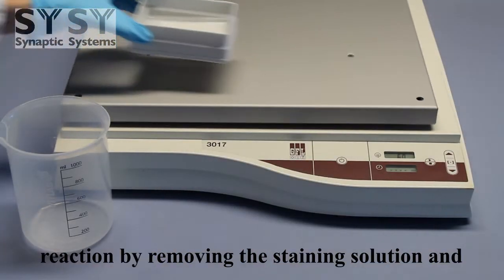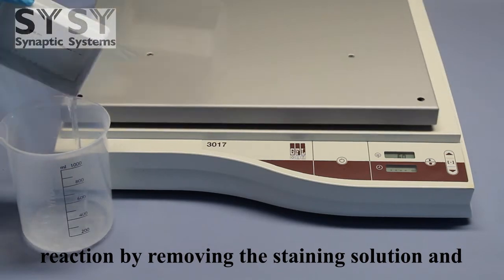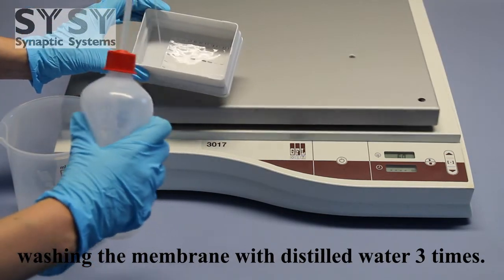Stop the staining reaction by removing the staining solution and washing the membrane with distilled water 3 times.